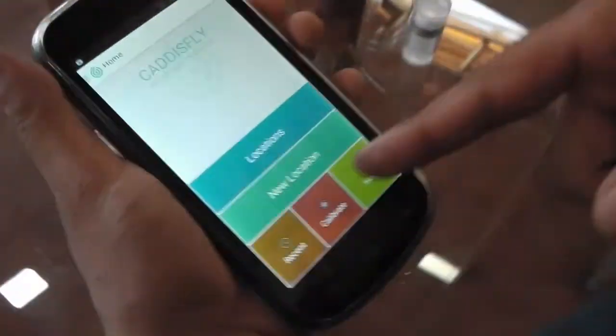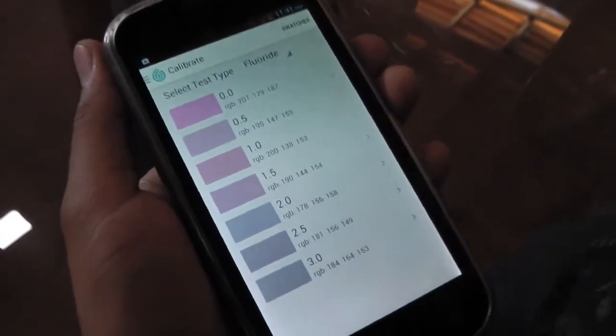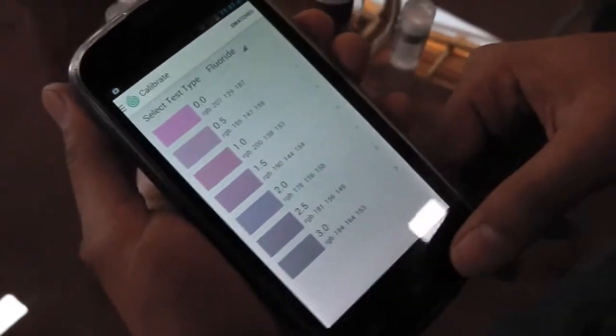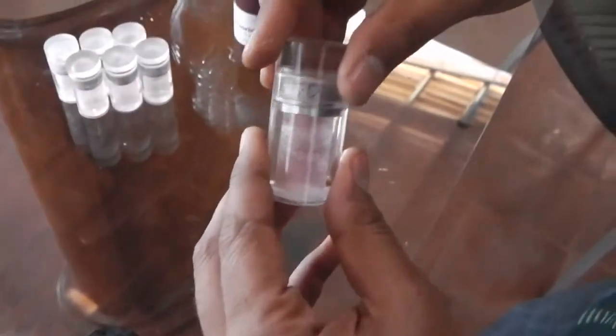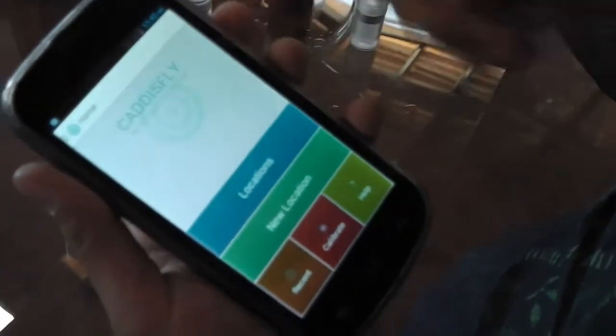Before you do any test, you need to first calibrate the device. The kit comes with a set of calibration cartridges. That's important because it gives the camera the right calibration so it can recognize the different colors it's going to be seeing and get the correct readings. The test is color change-based — once the reagent mixes with the water, the color changes, and the camera compares it with those previously calibrated values.